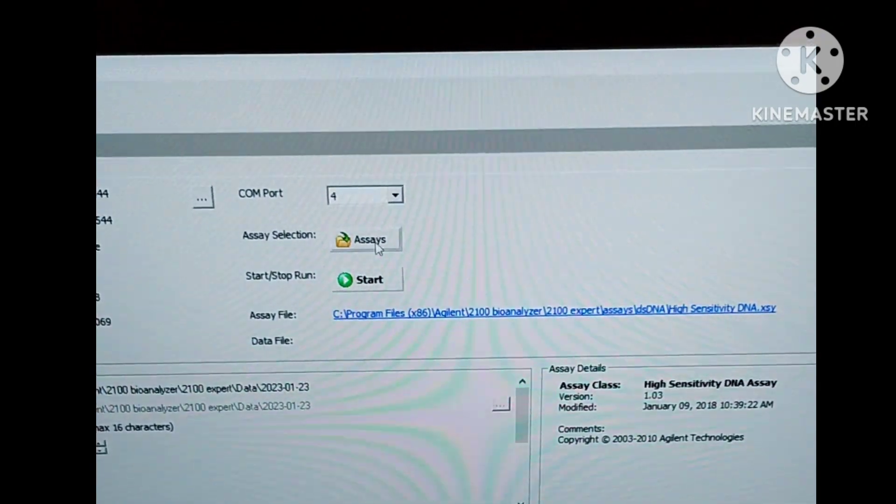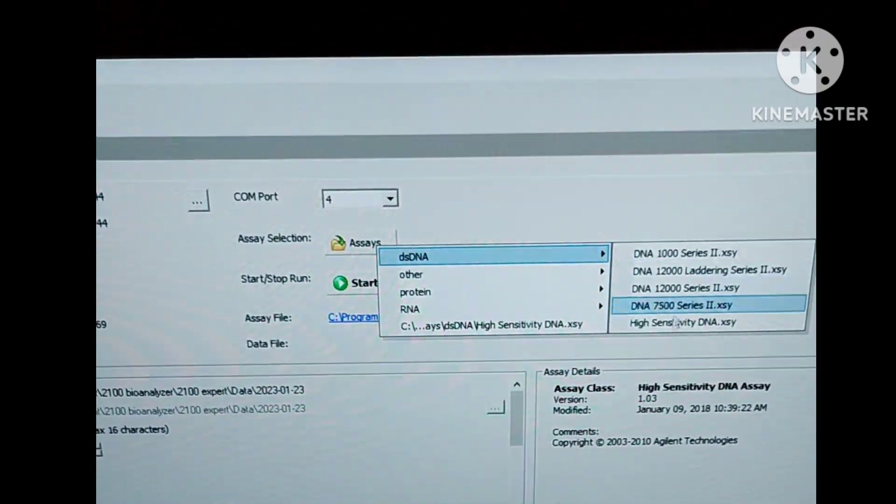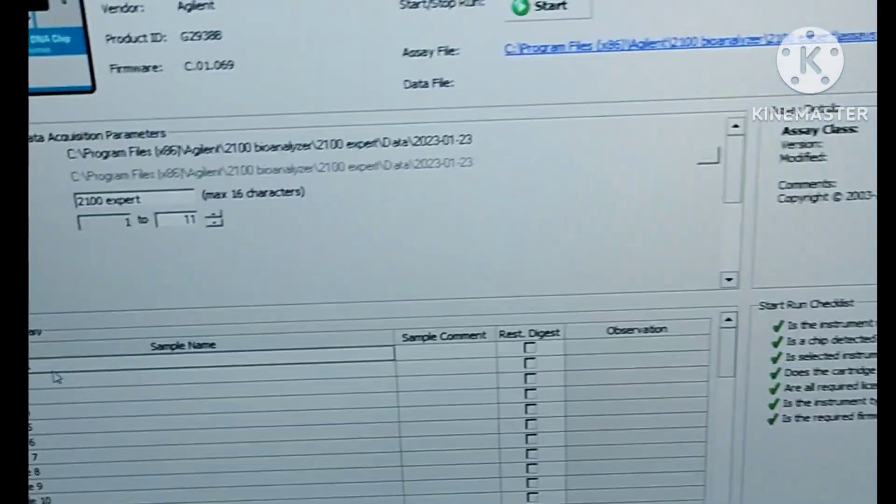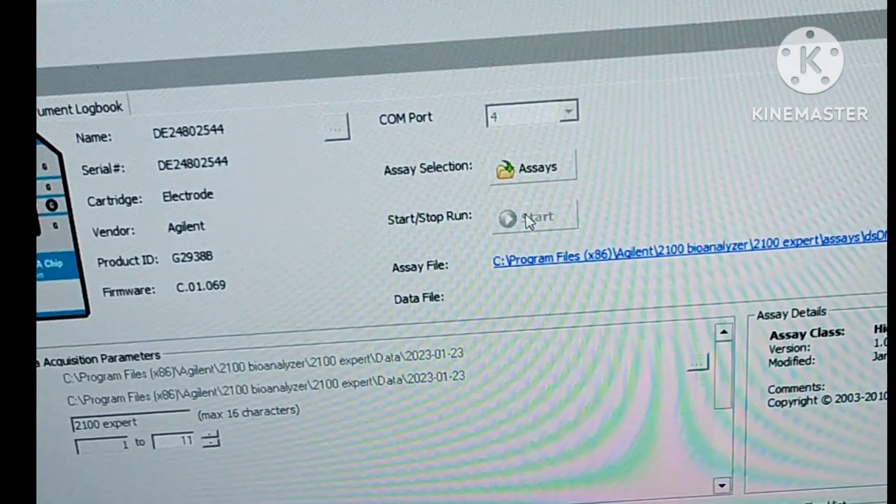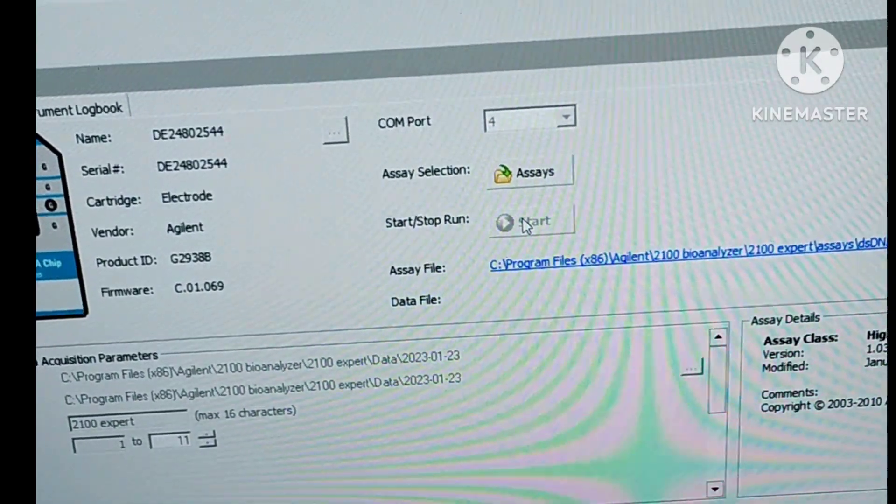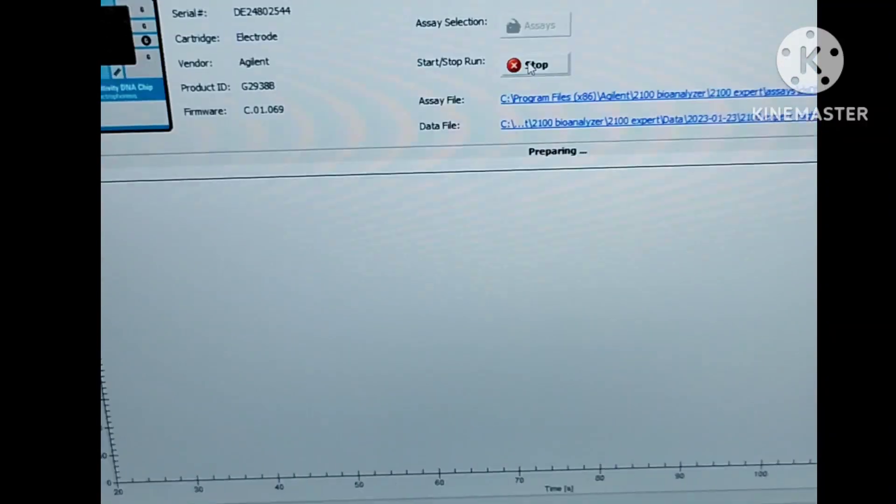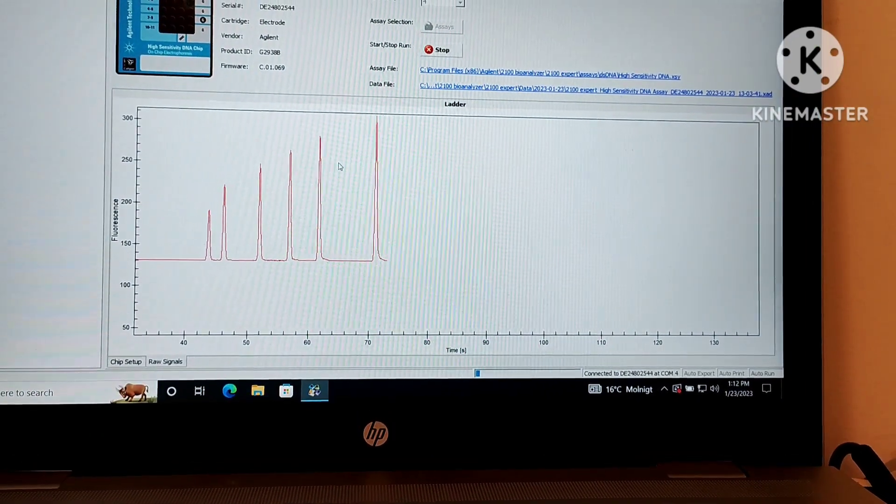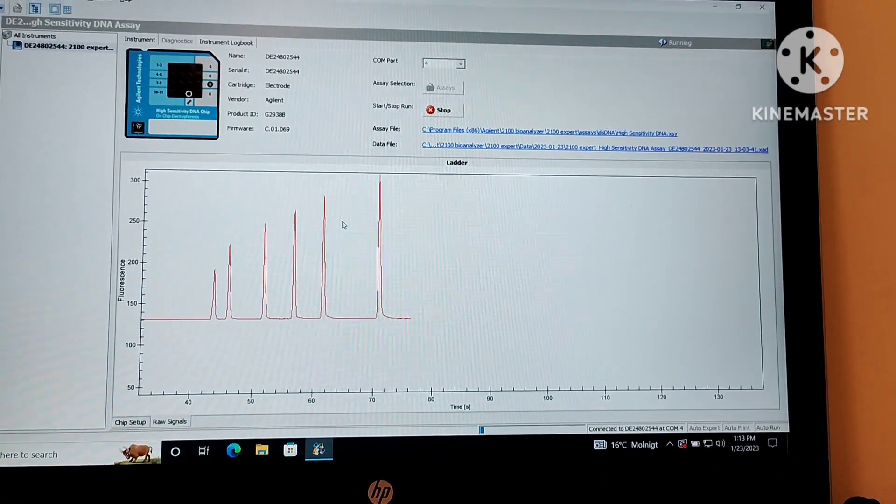Close the lid. Now you can see the software is detecting the chip. Use the assay—go for high sensitivity if you are using high sensitivity; otherwise, choose whatever you are using. Here you can write your sample name as well, and after you're done, just start the software. This is the reading for the ladder.